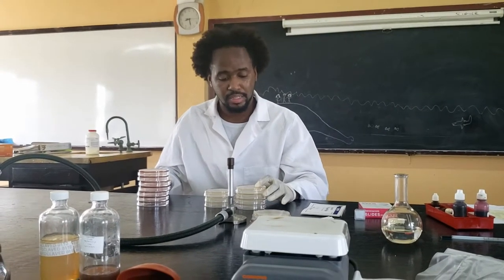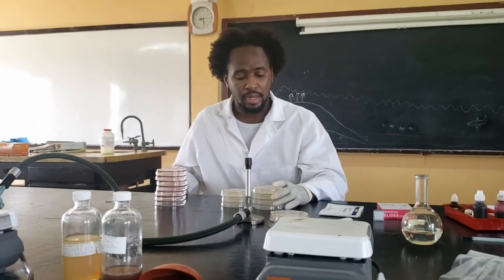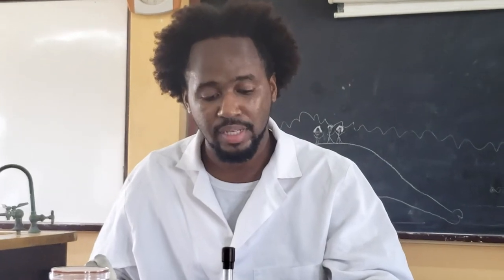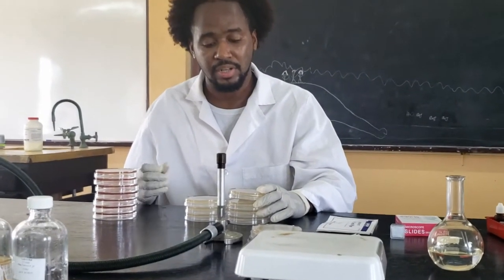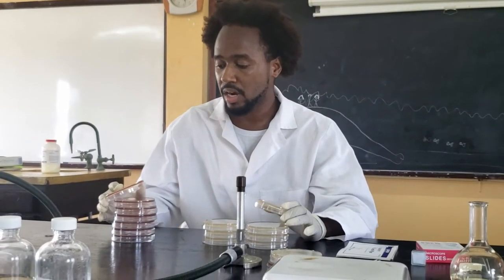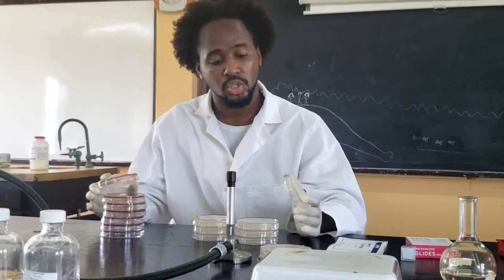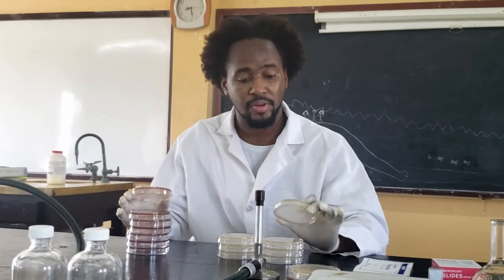Now agar is a media that they prepare from a sample that they get from red algae or some type of seaweed. This dry powder that they get is then mixed with either gelatin or other substances to make this gel product we call agar. Now there are different types of agar, with different uses. Today we have two types of agar that we'll be using. They're used to prepare different types of bacteria.